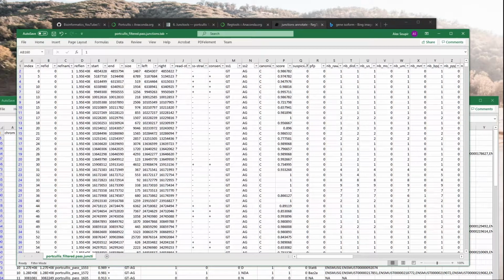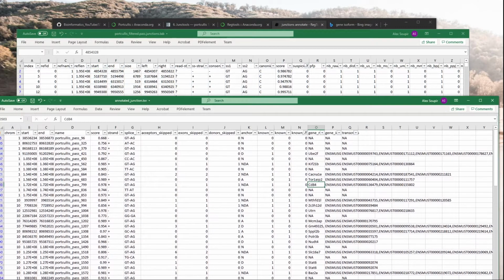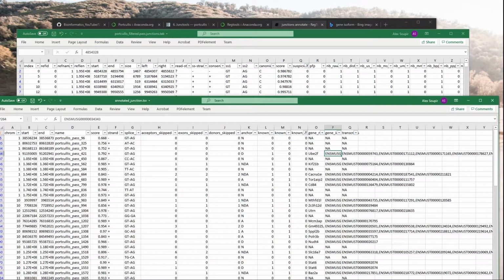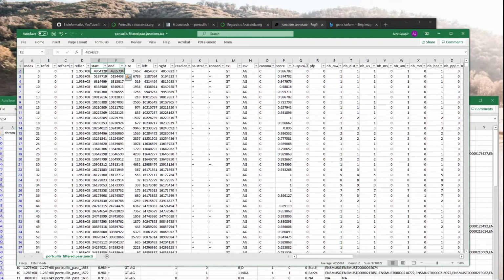But yeah, so here with looking at your unique mapping column, you could use this as your read counts for each gene, right? So you have your start and your end. You now have them annotated. So you can say, okay, that's this gene or this transcript combination, however you want to label it. And then compare between your irradiated mice unique mapping reads.